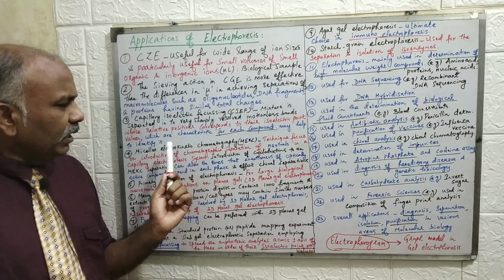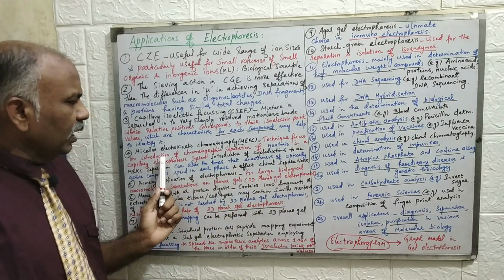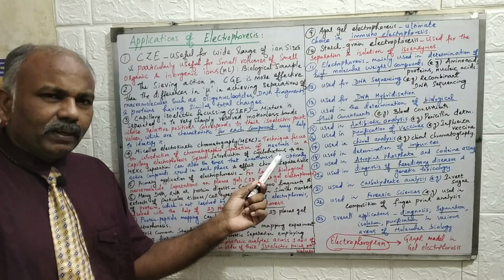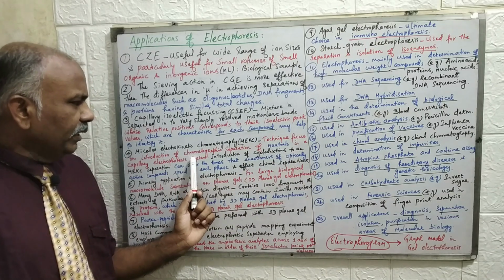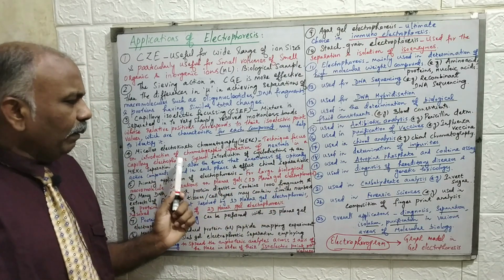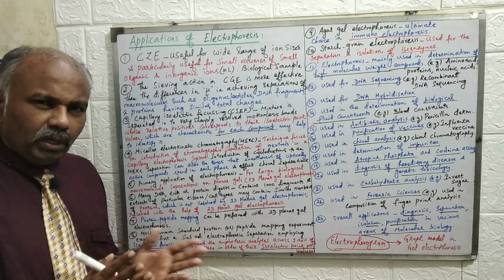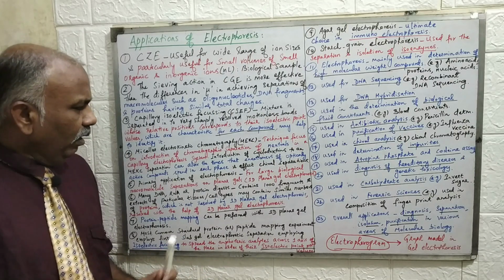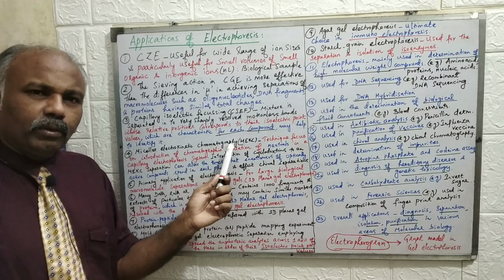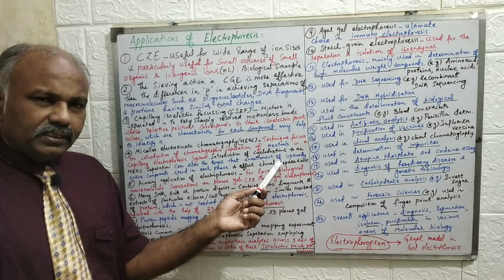This micellar electrokinetic chromatography is the technique focusing on the introduction of chromatographic separation of neutrals. This is very important, particularly the chromatographic separation of neutral compounds in a capillary electrophoresis system. If you want to see the separation of neutral compounds in an electrophoresis system, obviously the ultimate method is micellar electrokinetic chromatography.